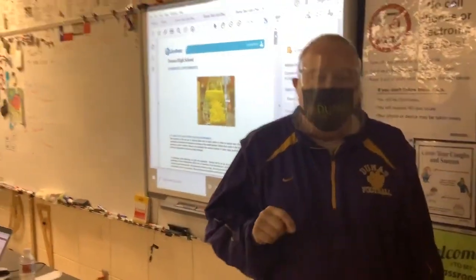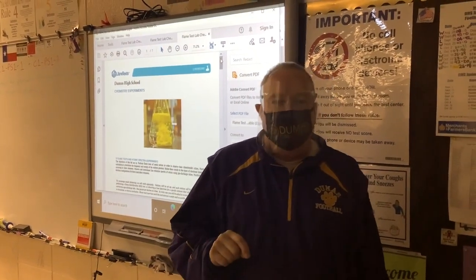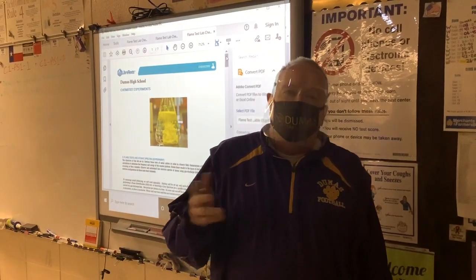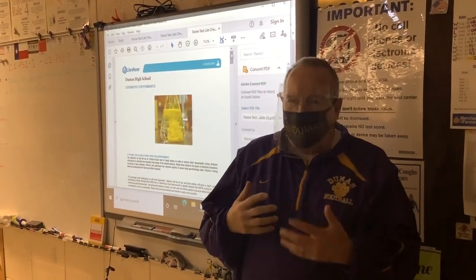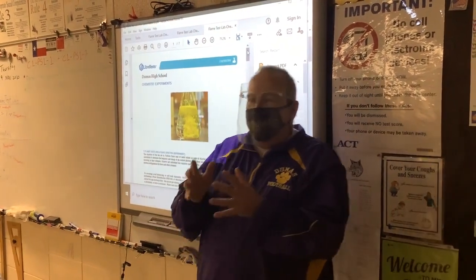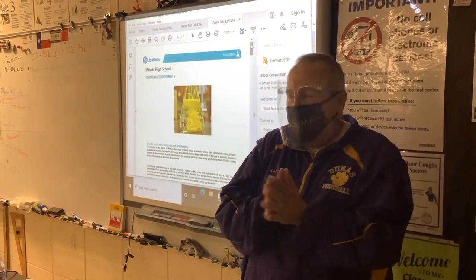examine the group 1 and group 2 elements, the alkali metals and alkaline earth metals from the periodic table, and their properties. And one thing we'll do is flame test. We'll also look at some of their chemical properties and how they react. But right now, let's talk about our flame test, especially and specifically as it relates to atomic structure.